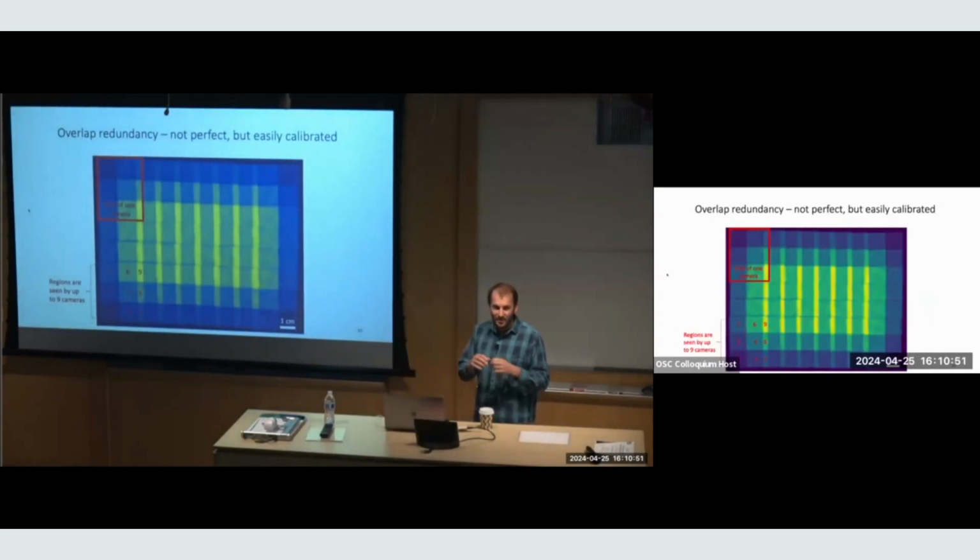And you can see immediately that in our design, when you start changing the focus of these lenses, it's hard to get everything really tiled together perfectly, right? And so naturally, when we do these 3D recordings, we always have to capture a pre-calibration image. So we image something patterned and fixed that we know. From that, we can figure out what camera is seeing which feature. It's pretty important. You'll also notice that when we do this multi-view imaging, the number of viewpoints is not fixed across the field of view. It changes. That's just because we have natural edge effects and imperfect overlap, right? But we've settled on this type of design.